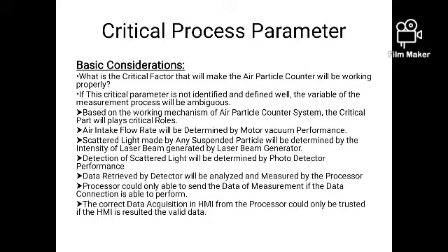Second is laser beam shooting with the suspended particles as target. The laser beam should have a certain intensity and wavelength which can be read by the detector. Third is scattered light detection. Scattered light, as a reflected light after colliding with the particle, should be detected by the light detector. The light detector should be ensured working properly.